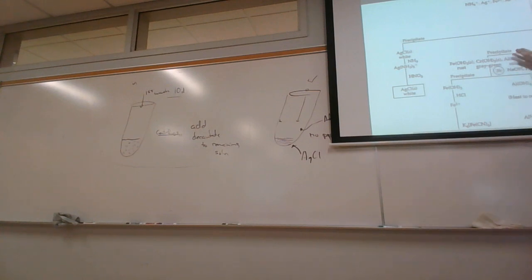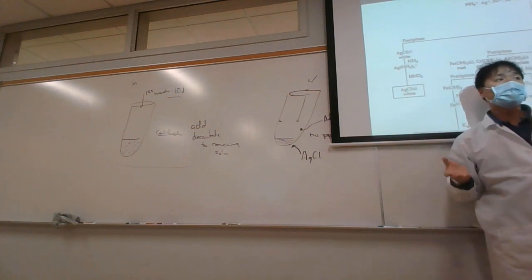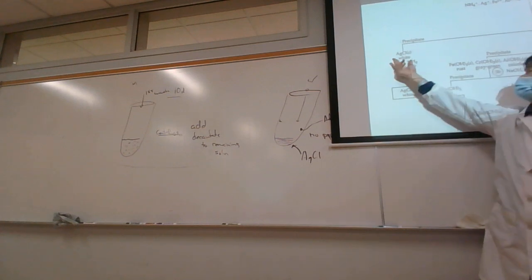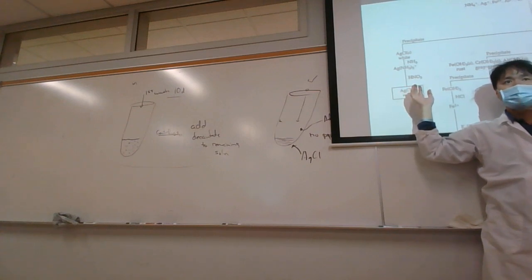All right, that's going to capture most of the remaining ions over here, but I don't stop at a first wash. Because if there's any residual contamination over here, let's say I didn't give a thorough enough washing, and some of the ions from over here are still remaining with the precipitate over here, that's going to screw up these results. It's called interfering species.